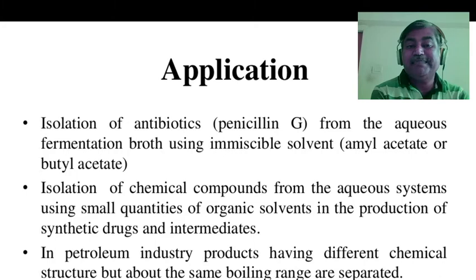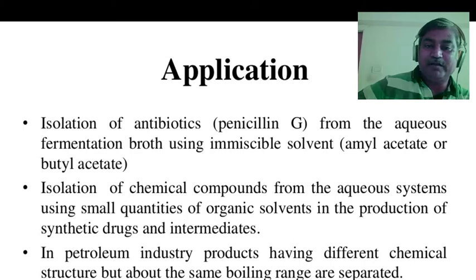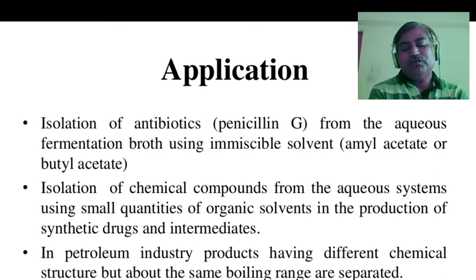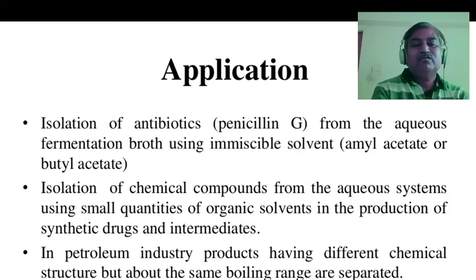For example, penicillin G. Penicillin G is one of the important antibiotics which is extracted by using aqueous fermentation broth, which is immiscible in organic solvent systems like amyl acetate or butyl acetate.